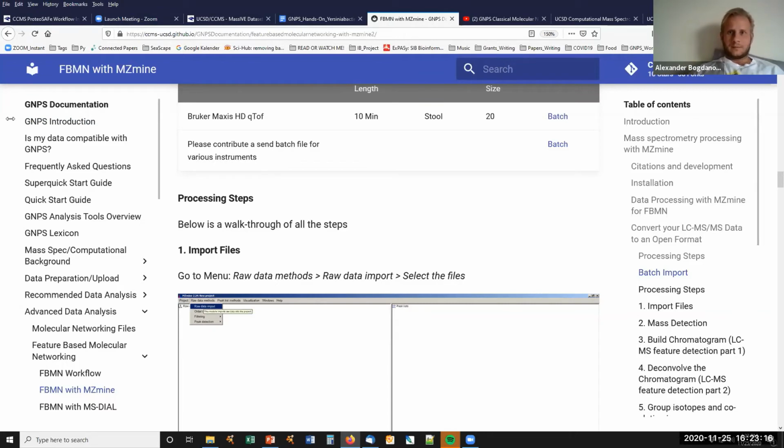You mentioned this phenomenon that occurs in classical molecular networking when I have two isomers with exactly the same mass but different retention time, and they are clustered together and produce one node. But nevertheless, I have some information on retention time when I review my data in Cytoscape or whatever. Which retention time is actually displayed? The first one, when the first molecule occurred, or no?